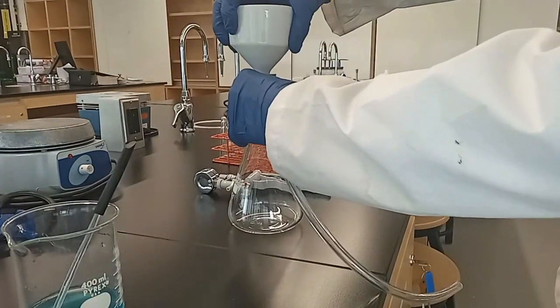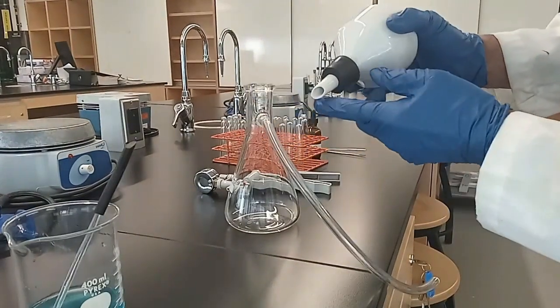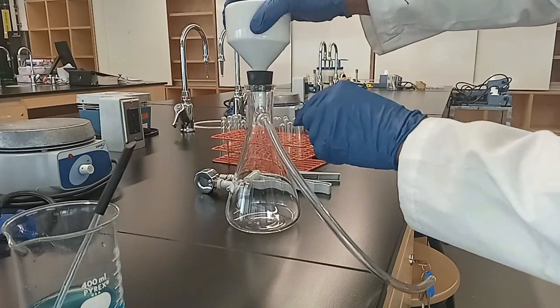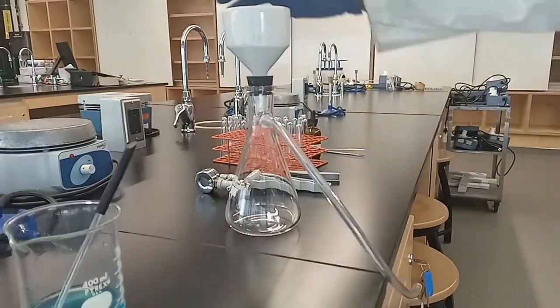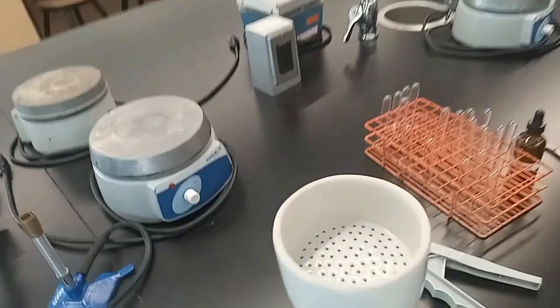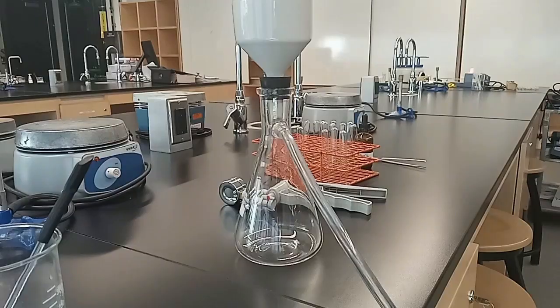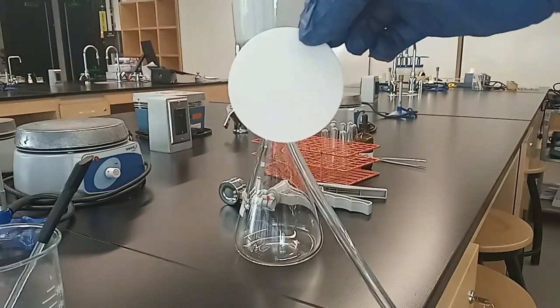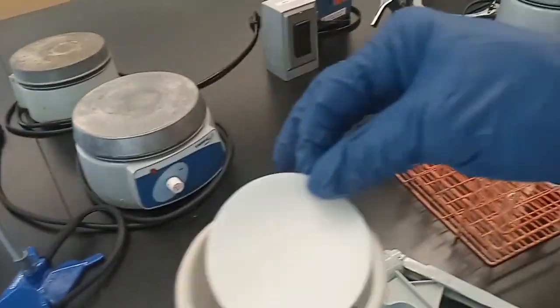Hi everyone! Place the Büchner funnel on top of the flask such that the tapered portion is facing away from the sidearm of the vacuum flask. Place the previously weighed filter paper such that it covers all the pores of the Büchner funnel.